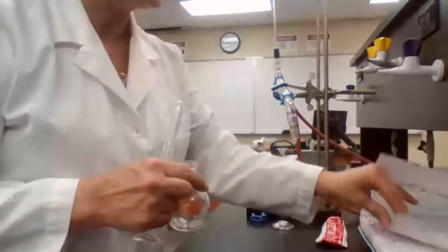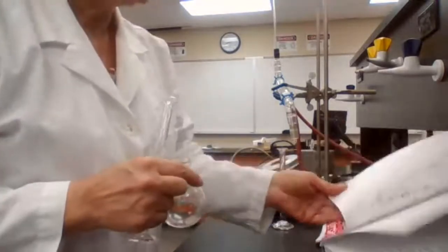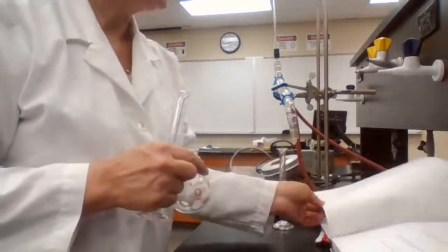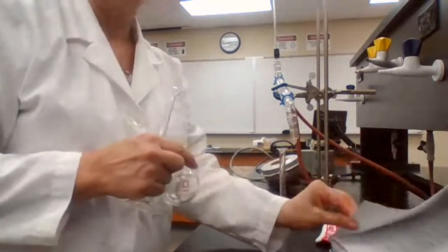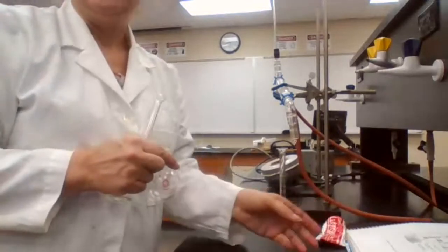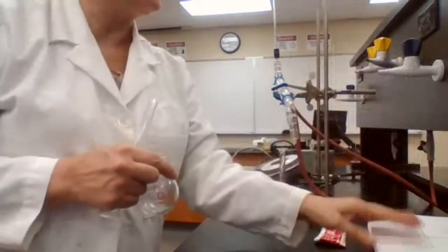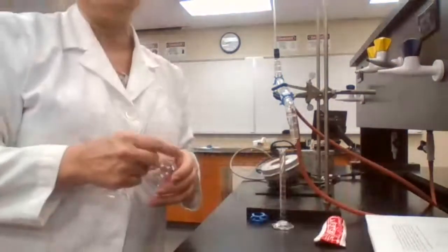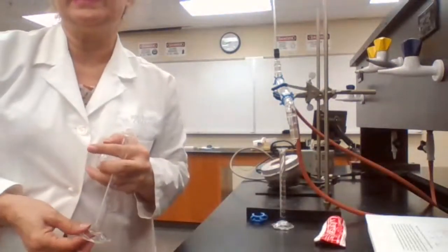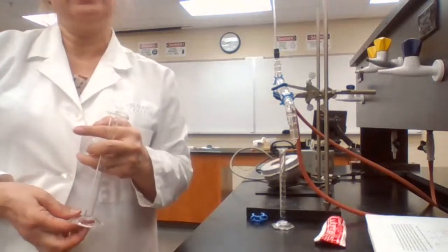Do you know which chemicals you're using? Very good. So we're using cyclohexane and toluene and 10 milliliters of each. We are going to mix it, and bring it right back. One was for sealing, that's the greasing, and what is the other reason?